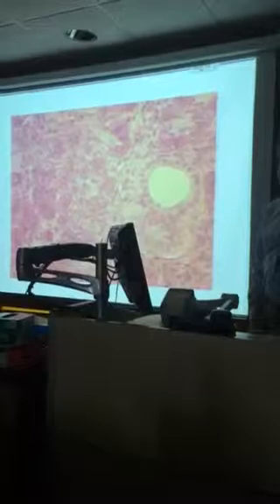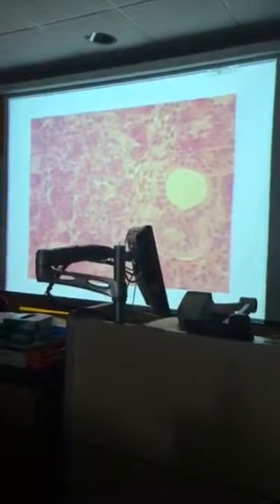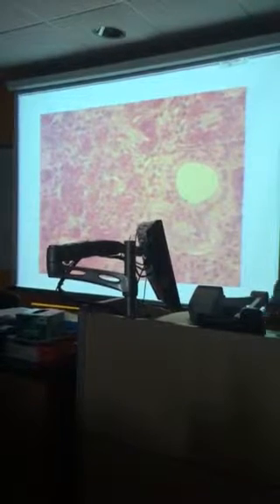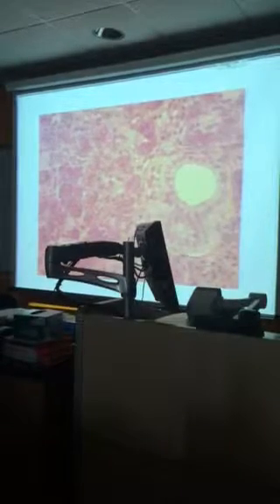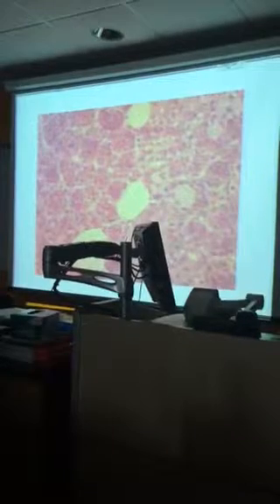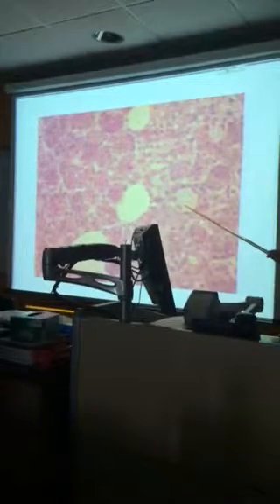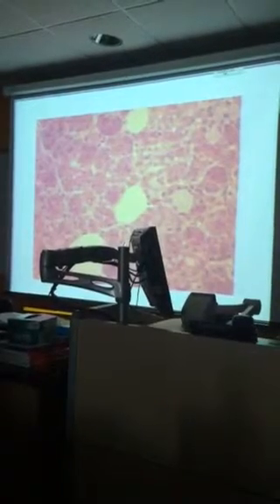Blood vessels are lined with what kind of epithelium? Simple squamous, which means you have a single layer of flattened nuclei, indicating a single layer of flattened cells. In the salivary gland ducts, the small ducts are usually simple cuboidal. The large salivary gland ducts are often stratified, as we're going to see. Okay? So not all the holes are fat cells. Now these are. There again, you got some mucus cells, and then the dark ones around it, again, are serous cells.